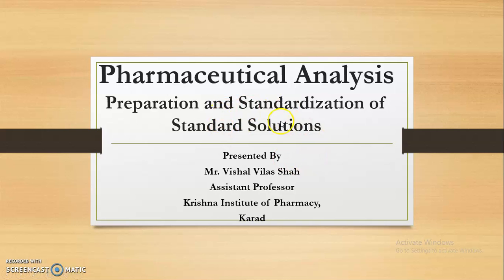In this video, we are going to discuss the second part of the preparation and standardization of different standard solutions. In the previous video, in detail, we discussed how to carry out the preparation of oxalic acid and standardization of it, as well as of the 1 molar sodium hydroxide.